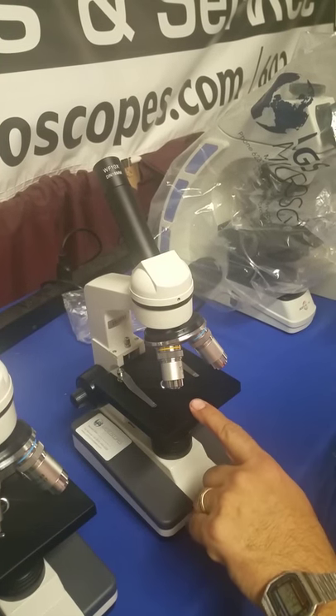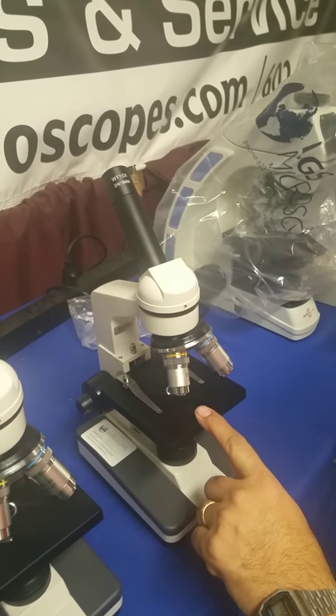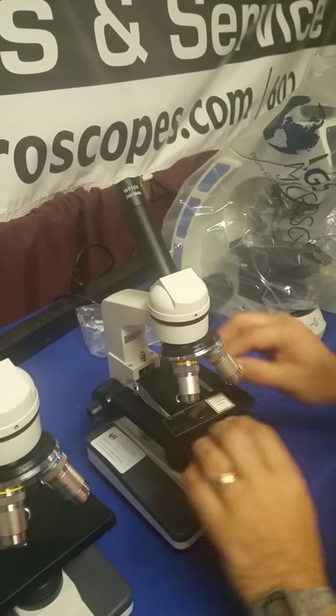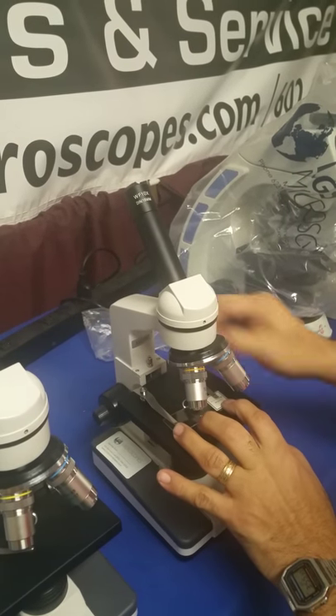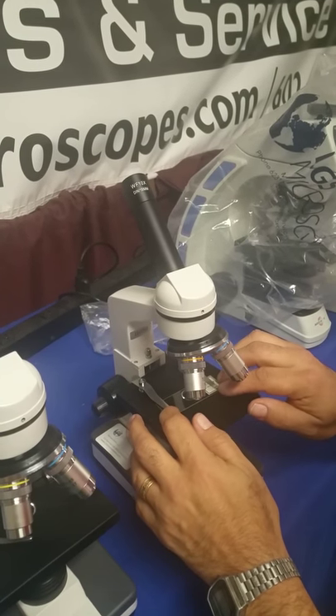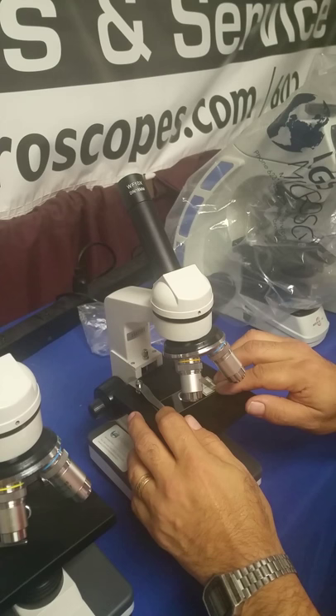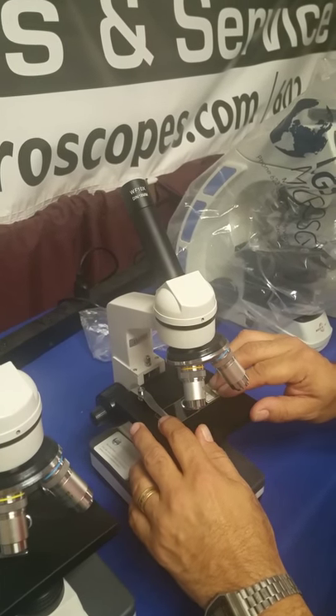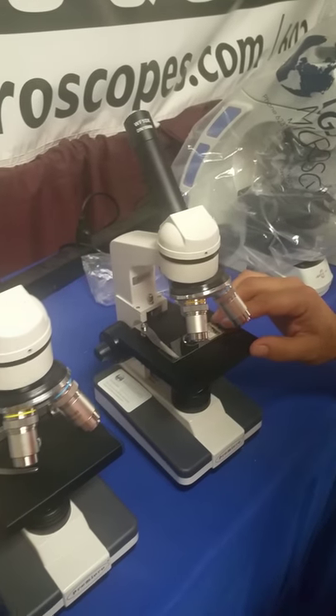This is a standard K12 microscope that comes with independent stage clips on both sides. You carefully put the microscope slide underneath the stage clips, then move the slide specimen into position. You can move it around with your fingers in order to look at different locations on the slide.